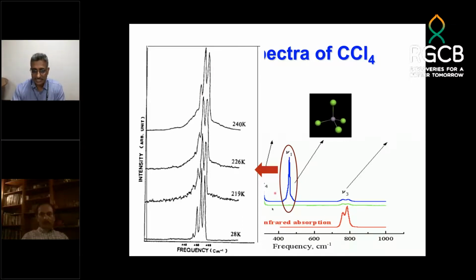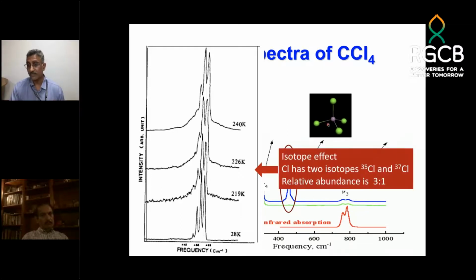Now, what is the reason why this should have been a single peak, but we have multiple peaks? Whenever I have asked, people have not been able to answer, but I have already given you the theory of Raman. Basically, the peak is because of the Raman, and the Raman peak depends on two things: one is the spring constant, and the other one is mass. Now, you know that in carbon tetrachloride your spring constant cannot change, but you have something called isotopes, and in that case, you have a change in mass.